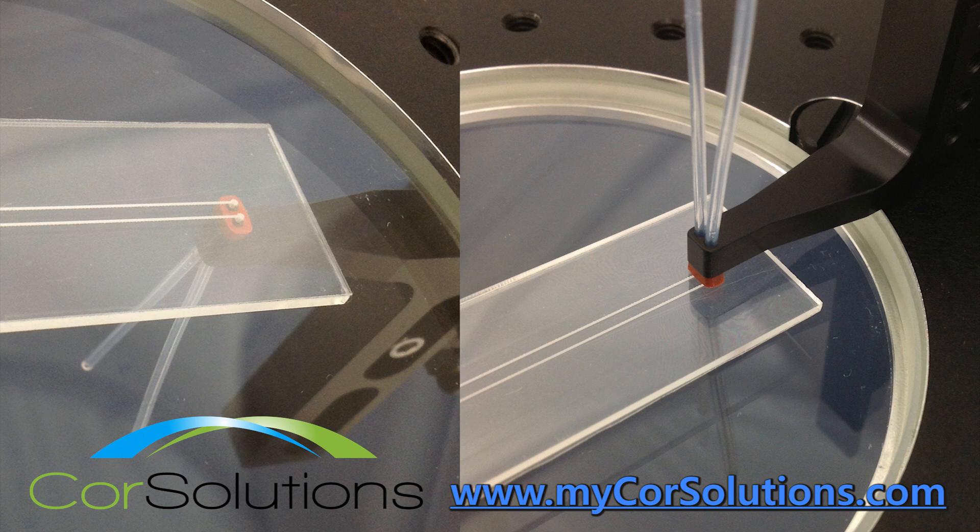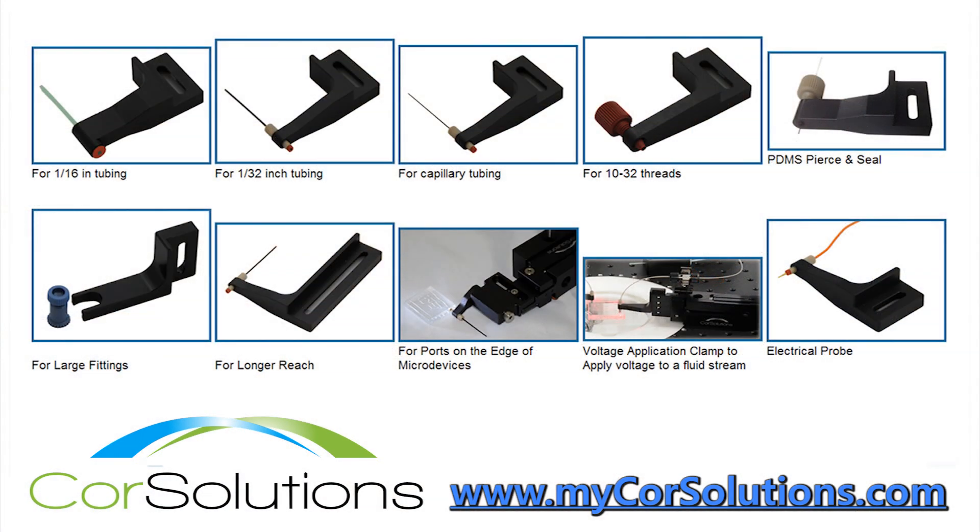A variety of Core Solutions Probe end attachments are available. For high pressure applications, nuts and ferrules can be ordered with these attachments.